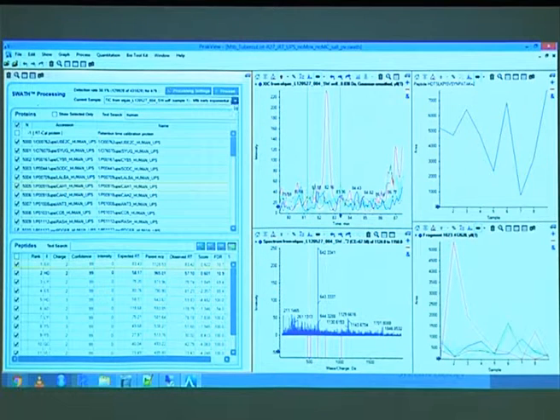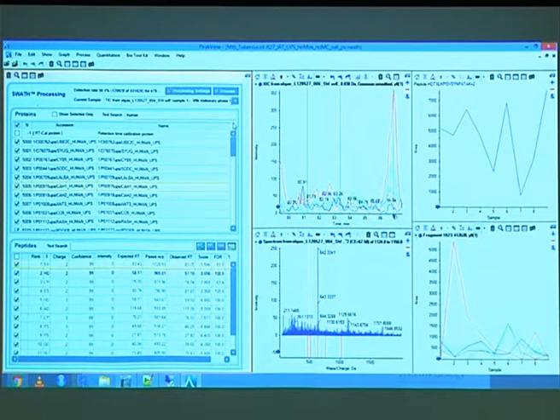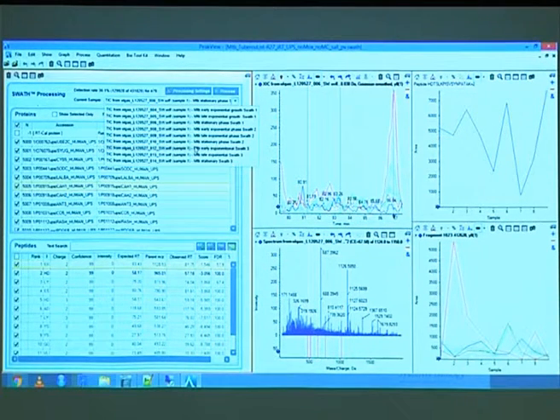What you can do as well is move around and see what the retention time looks like. This is 83.36 right now. And so you see here it's like 86. It just jumps from one location to the other.